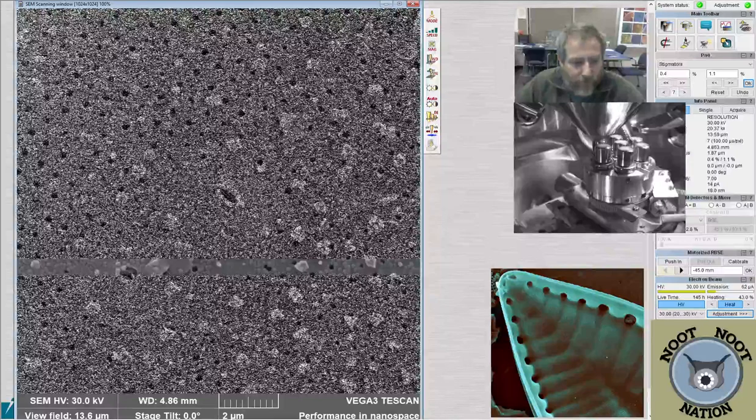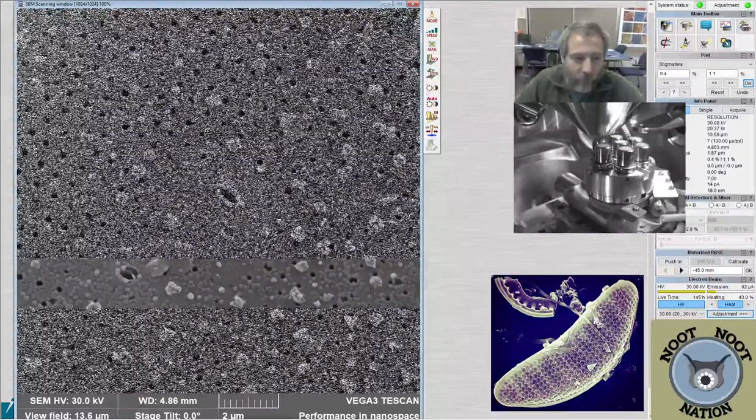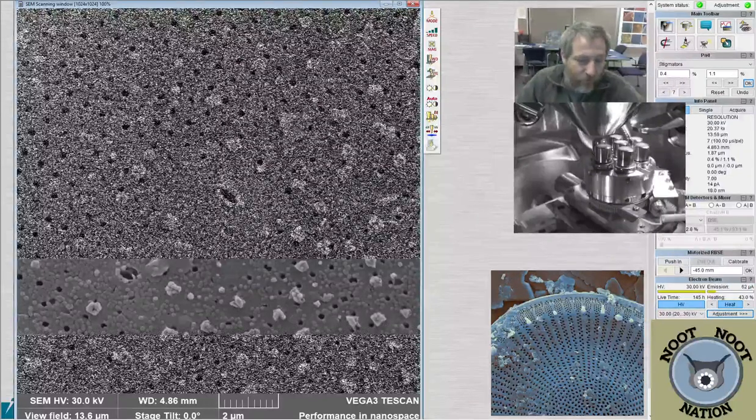So I'm just going to take a couple of little artsy shots here. What's important is you can see there's a bunch of little holes. These are the areoli. They are little portals that go through the cell wall, and it's a way for the diatom to acquire nutrients or exude waste.